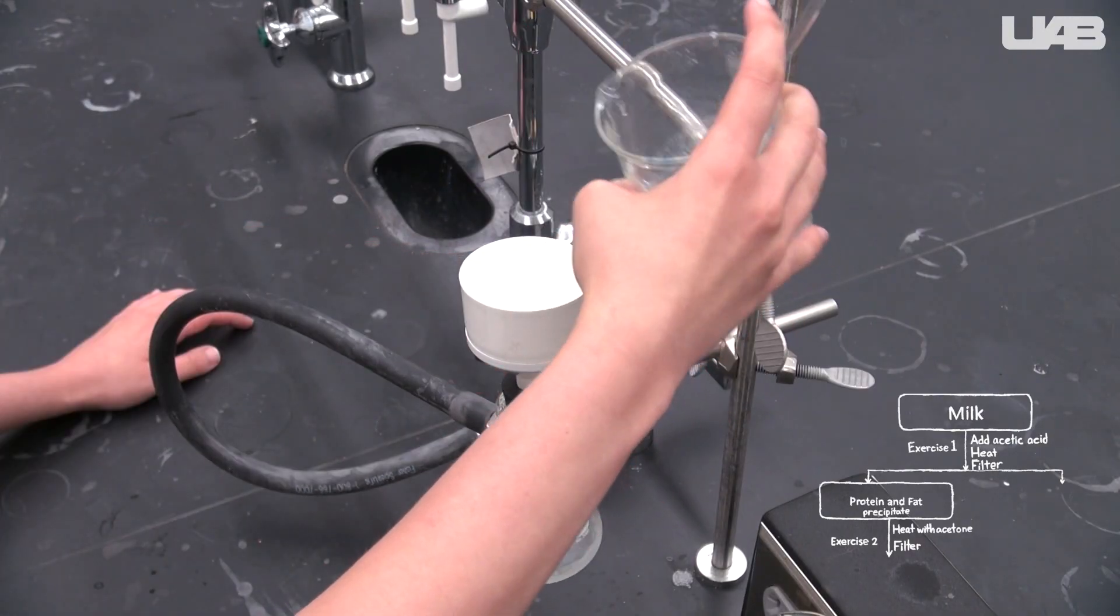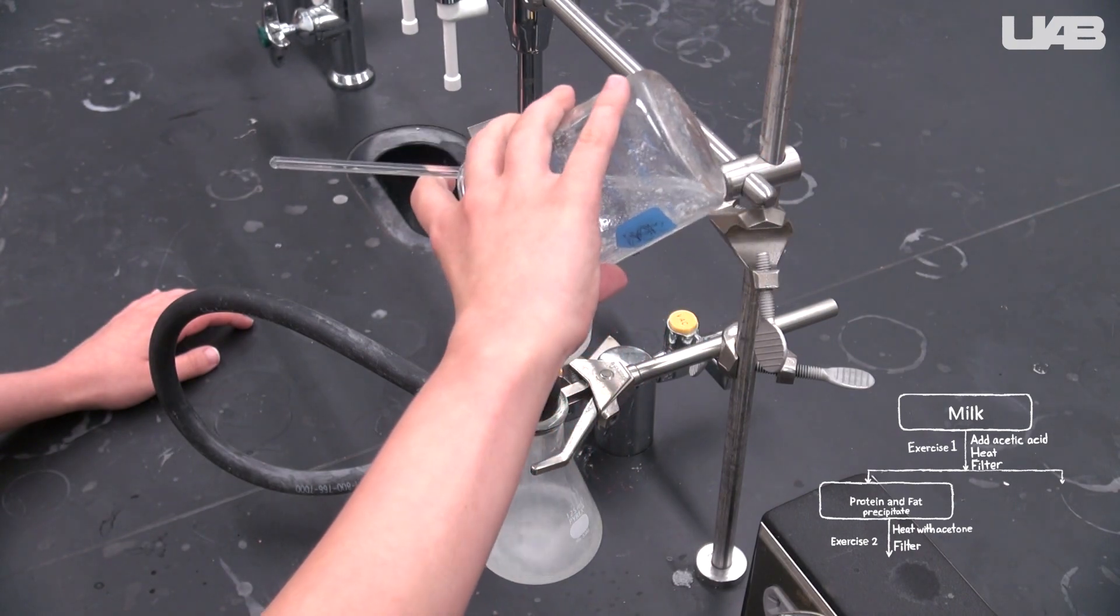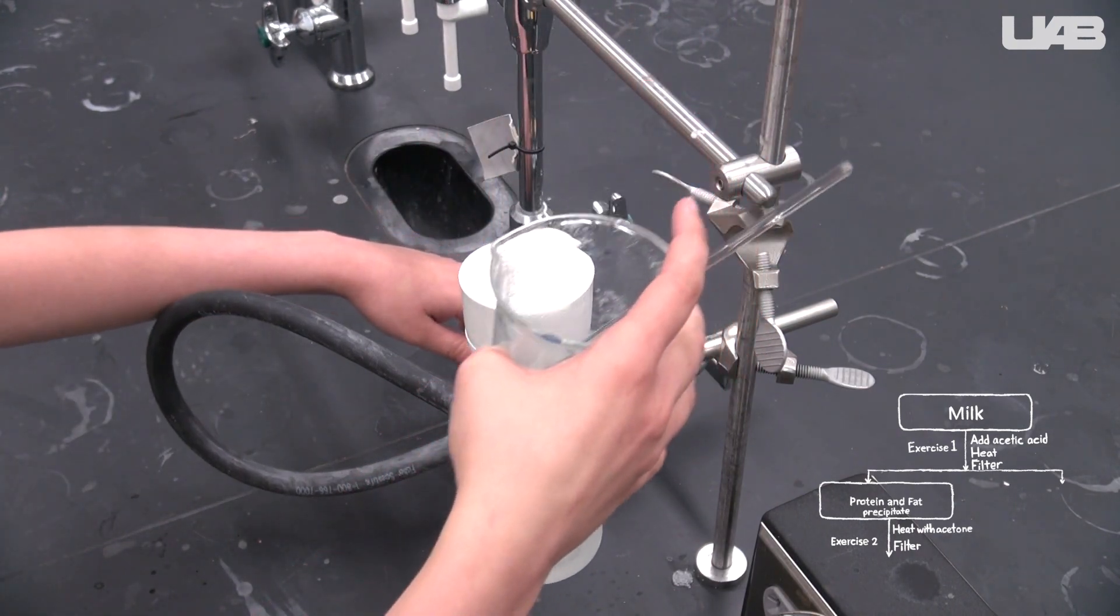When the solid starts flowing in, swirl the beaker and quickly empty it into the funnel to get as much solid as possible out of the beaker.